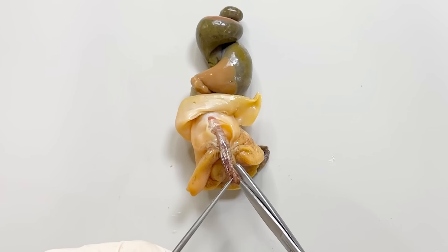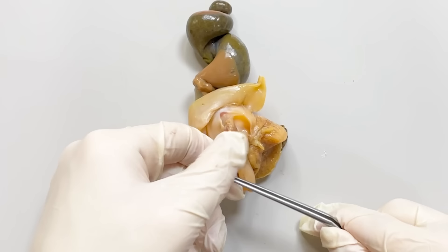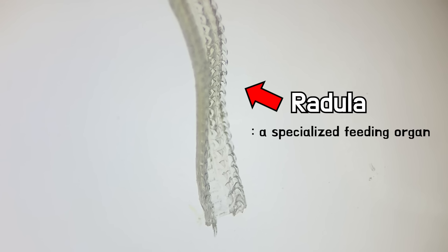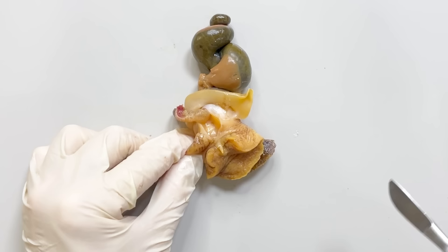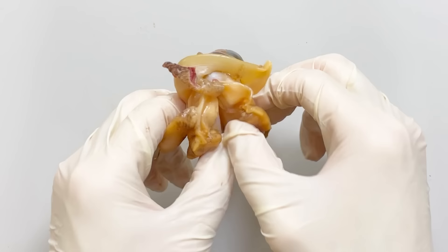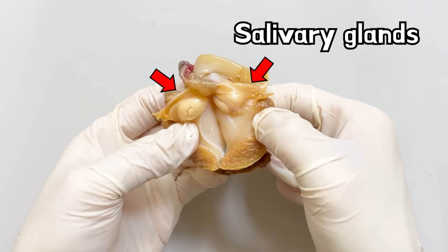Whelks use their radula to scrape and consume their food. By cutting this area and examining the inside, you can see the radula. If you split the part that leads from the mouth to the esophagus, you'll find salivary glands on both sides that secrete digestive enzymes.